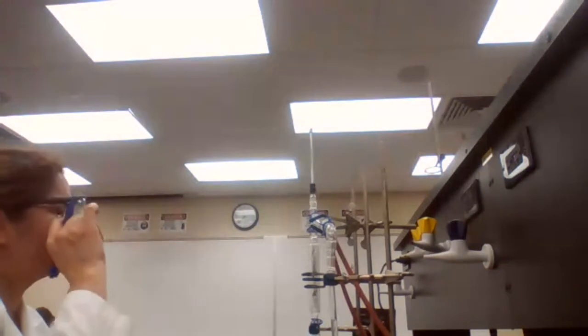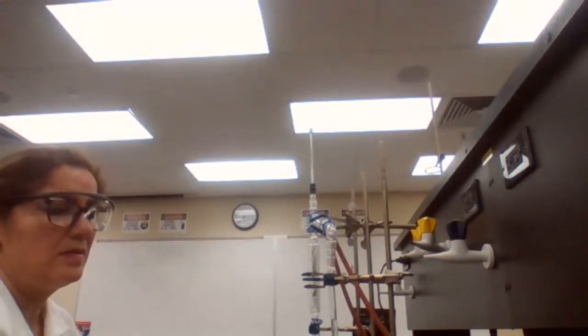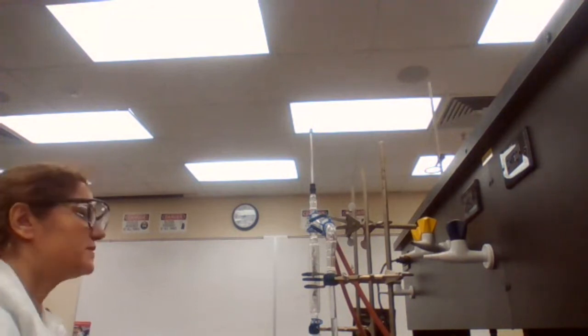6 milliliters is 76. It's kind of slowing down.